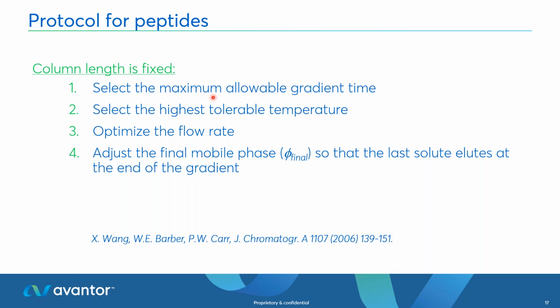Understand how much time you have on this system to dedicate to your project, to your sequences, to every single injection, because that will give you a more objective and scientific basis to arrive at this first decision with more responsibility.